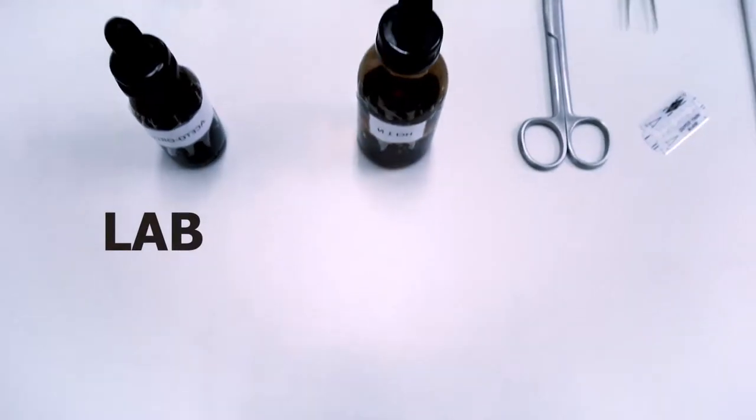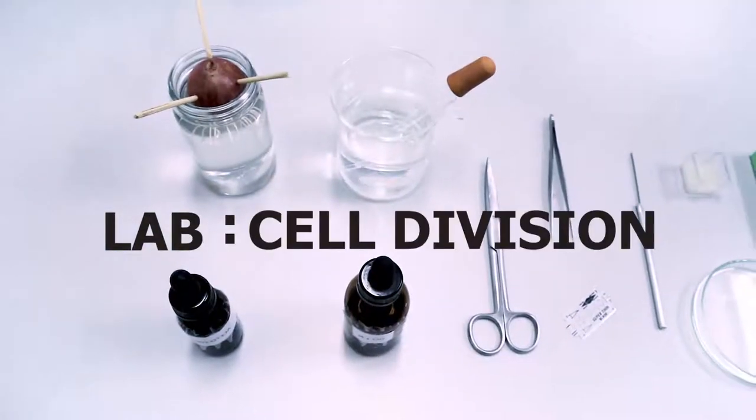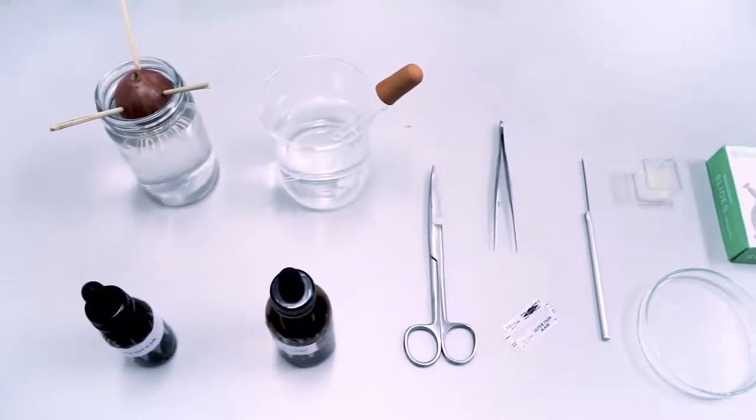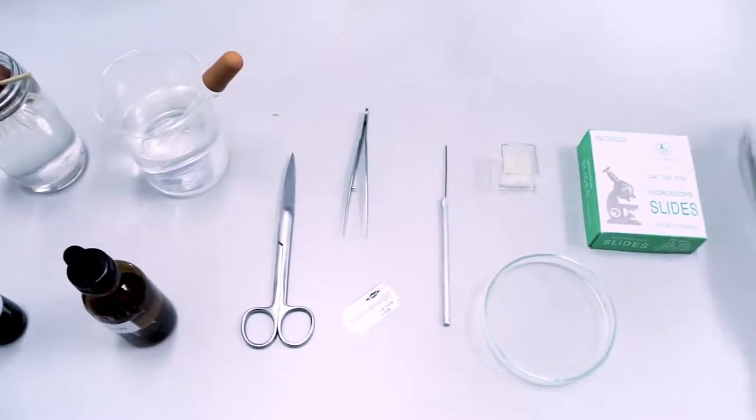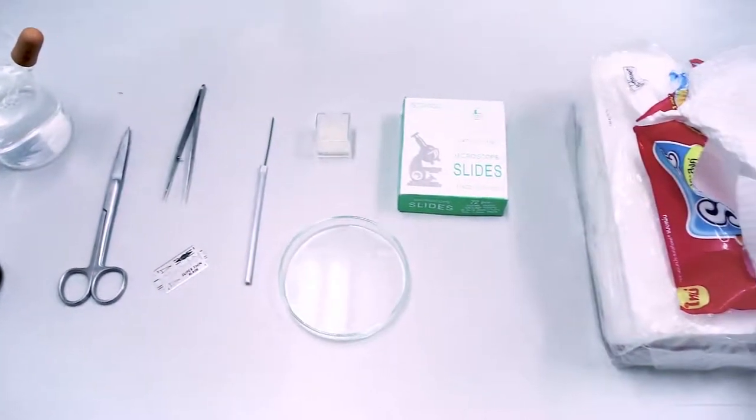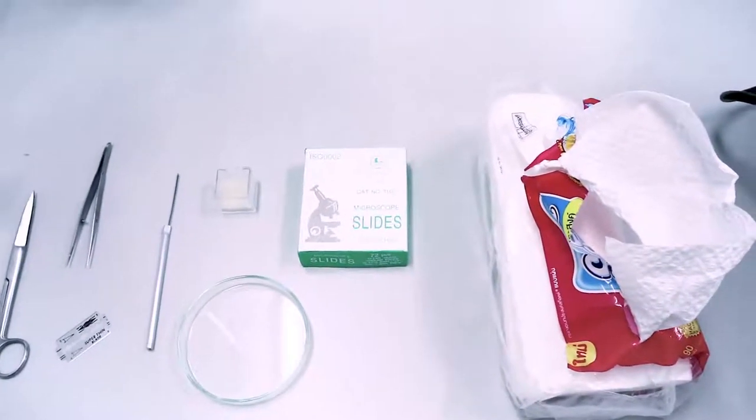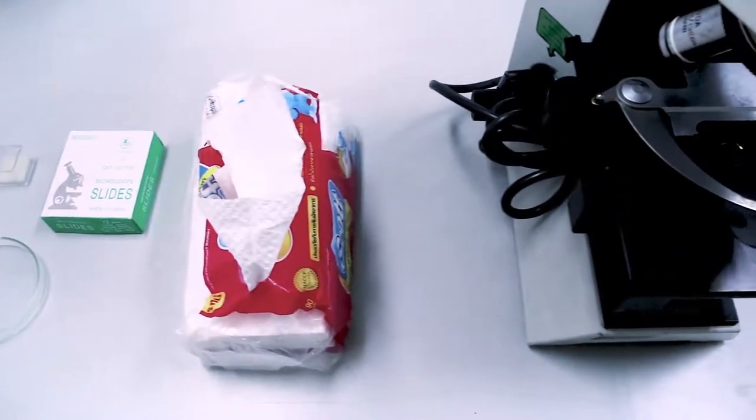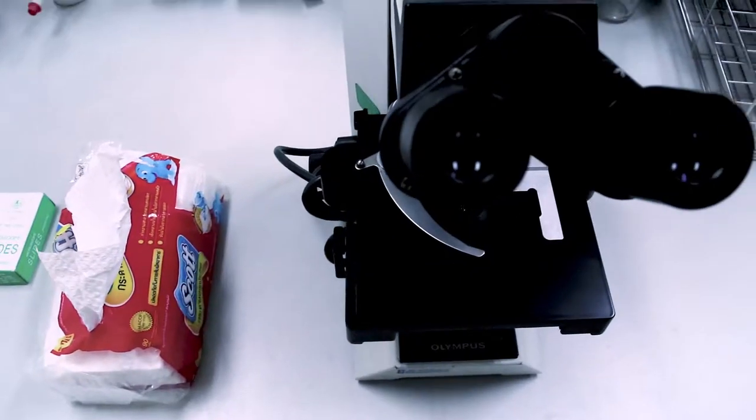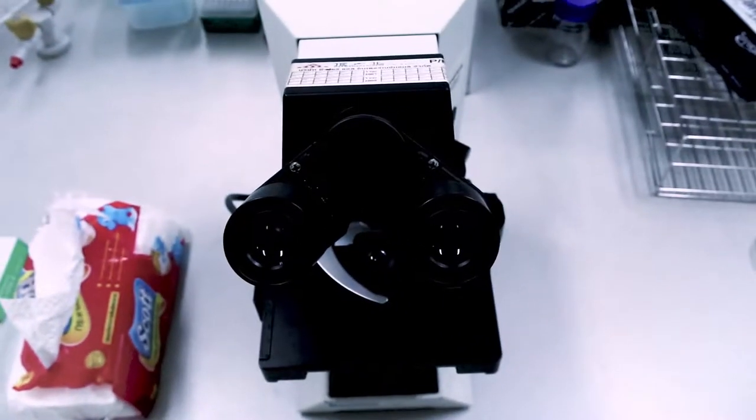Hello everyone, today we're going to show you how to prepare the slide for the mitosis root tip observation. Here are the things that you need in the lab and they should be ready on your bench.